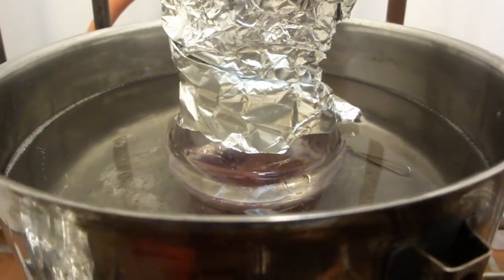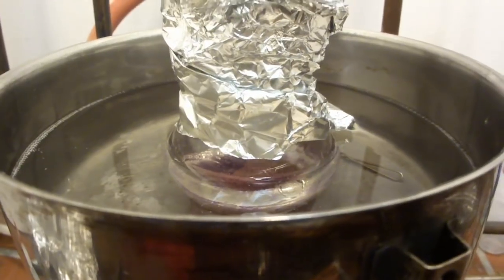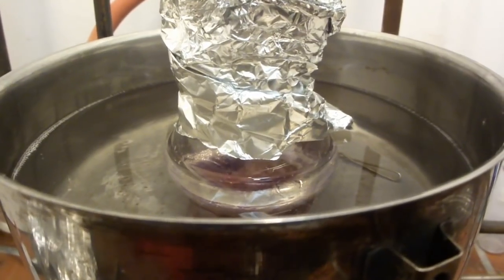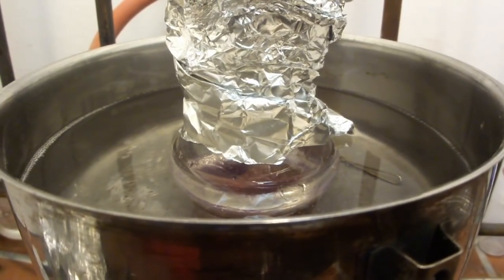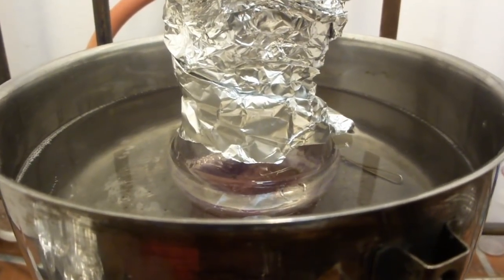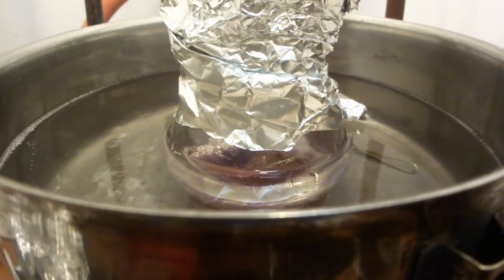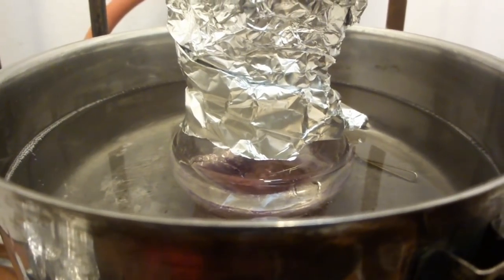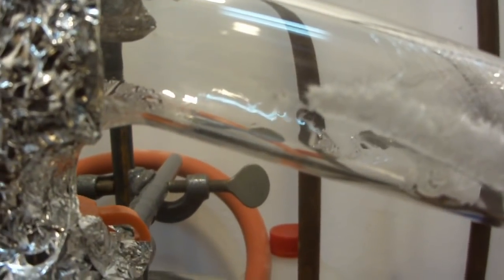So the volume is nicely decreasing in the distillation flask right there. So currently we did this in a 100 ml flask, which is a bit large for this, so we could have taken a 50 ml flask, but I was unsure about the foaming, so I could imagine that this would foam a lot, but it is very nicely behaved, so the next time we could use a 50 ml flask or the 100 ml flask and then use two of the heating bars right here. So this is just so nice.